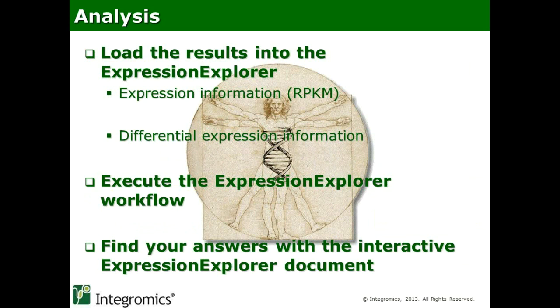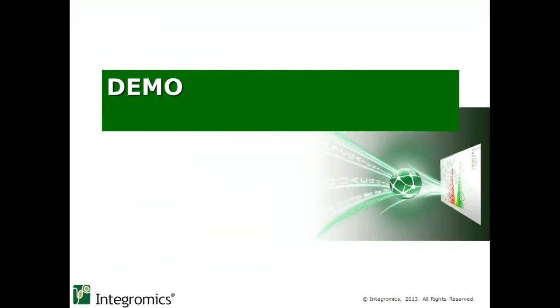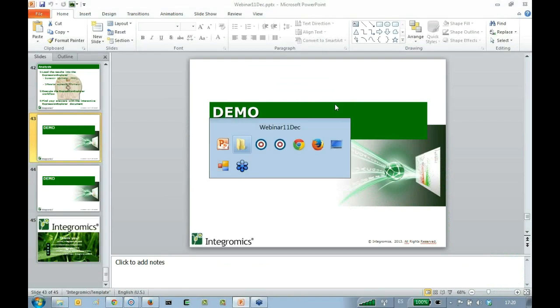Once we have loaded this information in the ExpressionExplorer, we will execute the ExpressionExplorer workflow, and then we will go through the document that's generated in order to see how we can explore these results. So now I will just pass over to the demo.